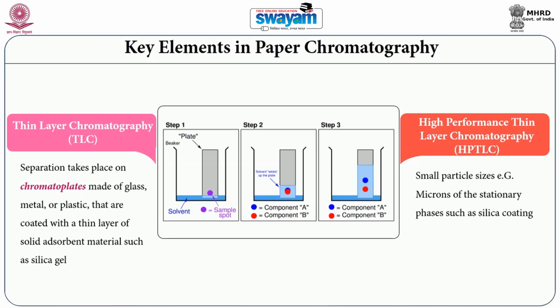So keeping in mind the properties of the compound that you're trying to separate, these plates can incorporate a compound that will fluoresce under UV light, and so your compound of interest, if it absorbs UV, can also be visualized. And typically for visualization, either short wave or long wave UV light is used. One of the compounds that will fluoresce under UV light is manganese activated zinc silicate.